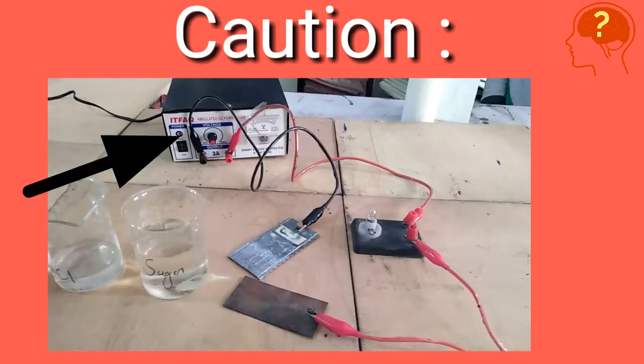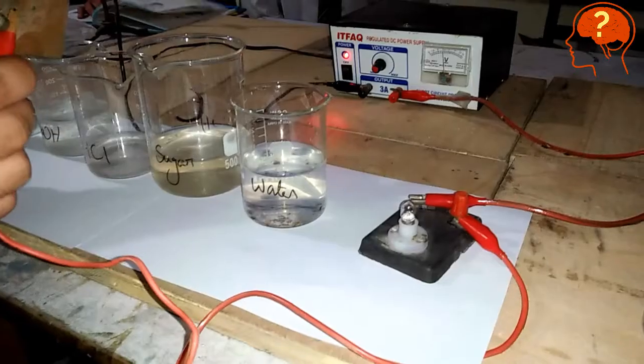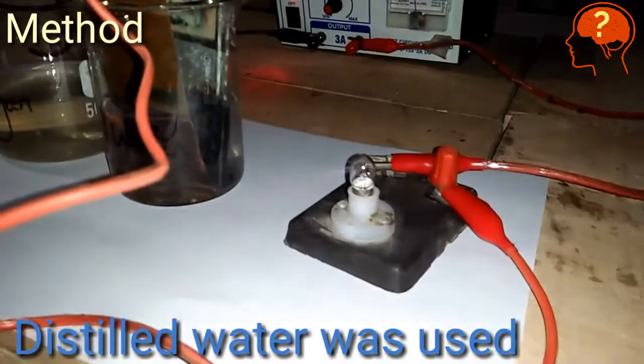Remember: connect the wire which is black in color to the terminal of the battery which is also black in color, and the wire which is red in color to the terminal of the battery which is also red in color. Now dip the electrodes into all the solutions one by one, starting with water — as you can see here.